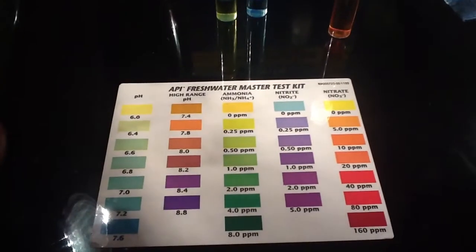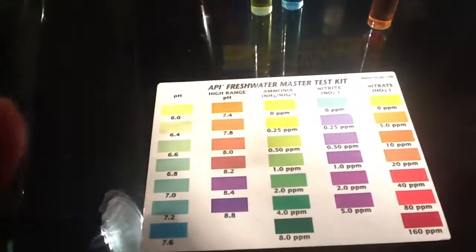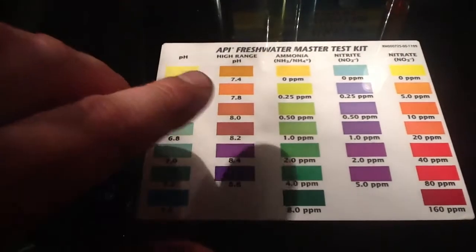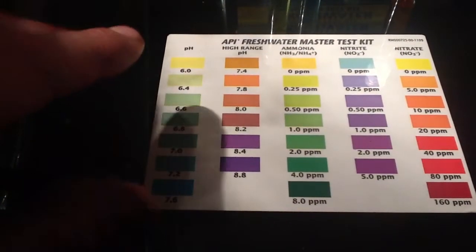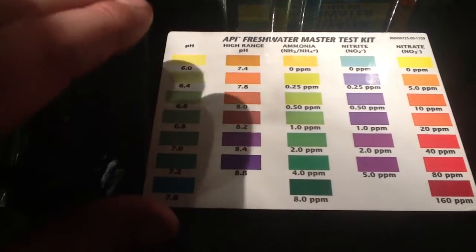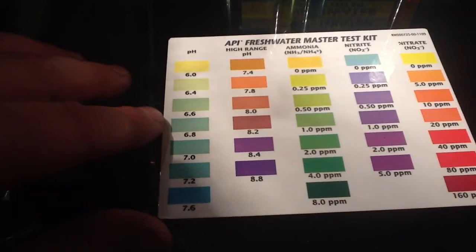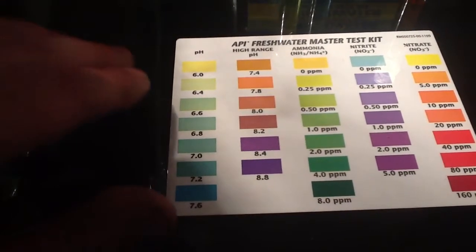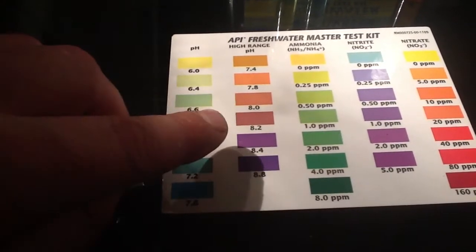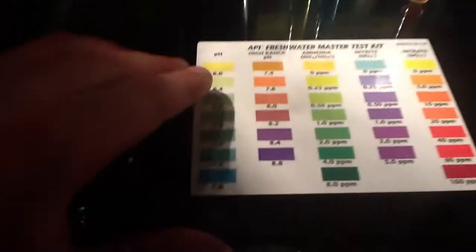Just a quick video showing you - I use the API test kit. Just so you know guys, I don't use that to test the pH, I use a test pen. Because it can be affected by other additives in your water - I add a discus mineral into my RO water which contains all the good stuff that discus need, but that affects the reading on the pH scale. So I've stopped using the little test bottles for pH.